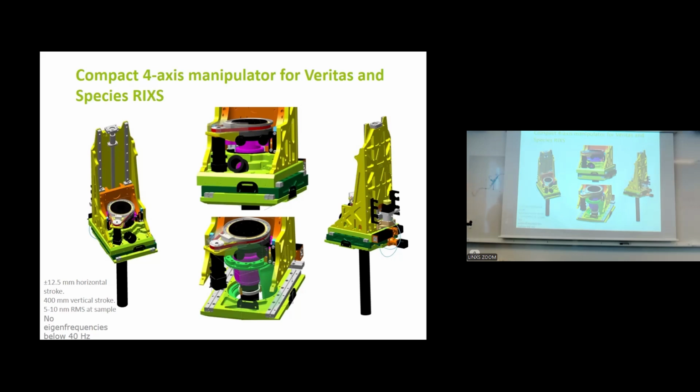Both of these developments, by the way, have not been commercialized, but they're available through collaborations. They are currently being used at the Sirius RIXS end station in Brazil. There's also one manipulator at the European XFEL, and there's interest from a few other places to have it also. We have published papers on both, so we want to keep it open to academic collaborators, of course.